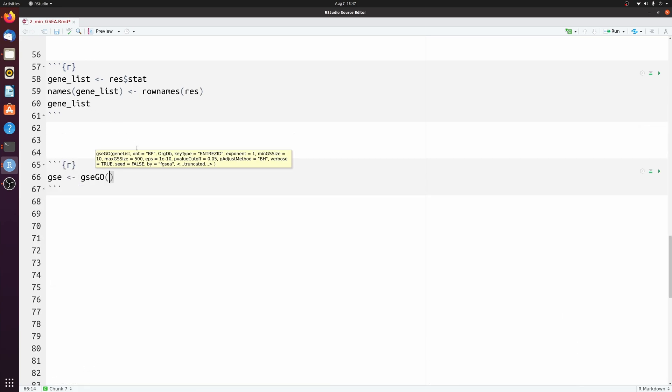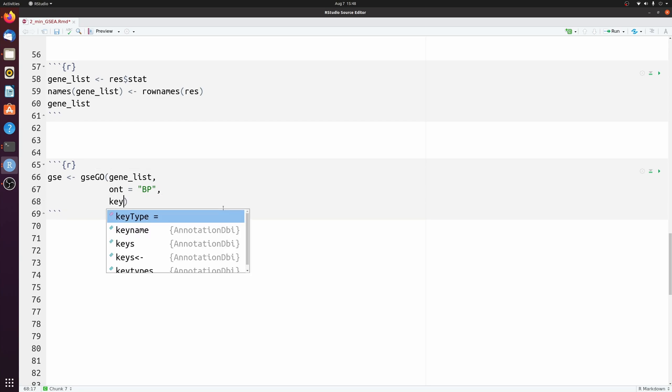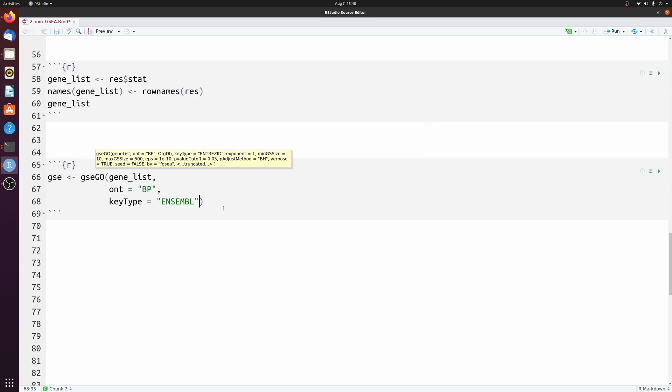And we're going to pass gene list. And biological processes is default, but I'll just show it here. You can change it if you want. And our keys are ensemble keys. So we have to specify that here.